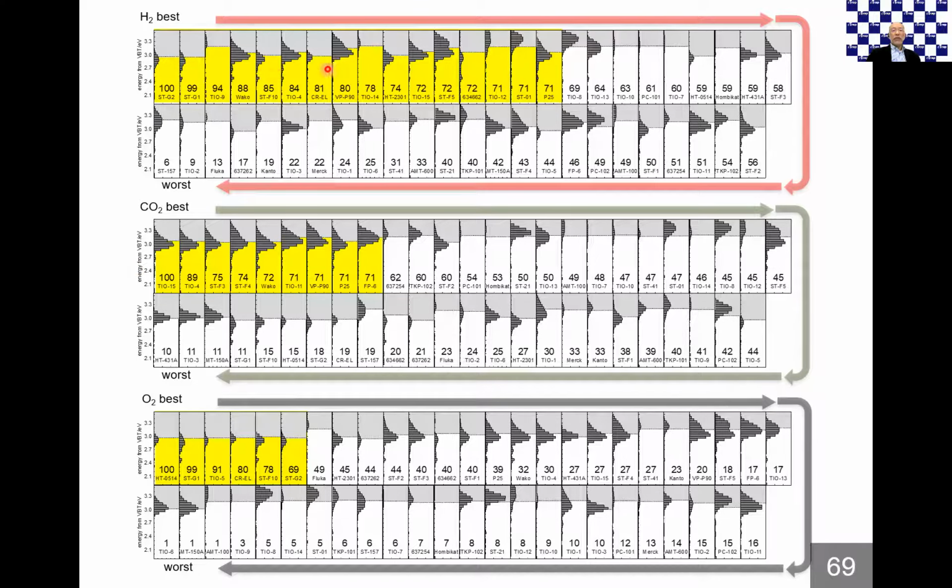However, for the hydrogen evolution case, there is no similarity among high activity samples. Therefore, it is possible to optimize the structure of the photocatalyst to give much higher photocatalytic activity. So this ERDT CBB pattern provides a new way of discussing photocatalytic activity-structure correlation.